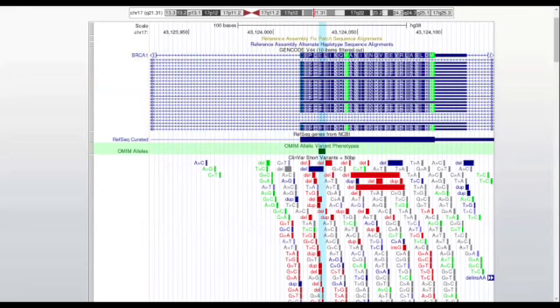So far, what I'm telling you is the UCSC Genome Browser. When you use the IGV, do you remember it's blank except for the bottom line where you have a reference genome? Here, you have a reference genome, and in addition, a lot of databases are automatically connected. In IGV, you can do the same thing by manually uploading them and showing them one by one.